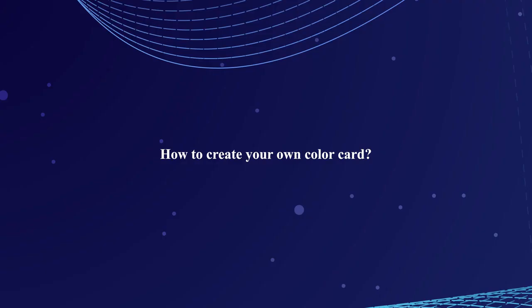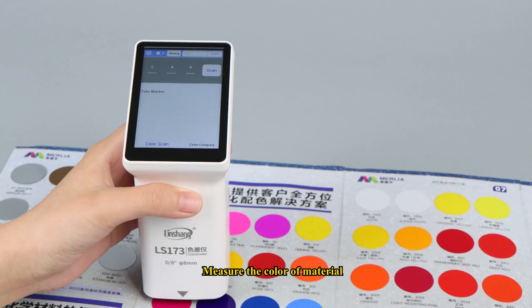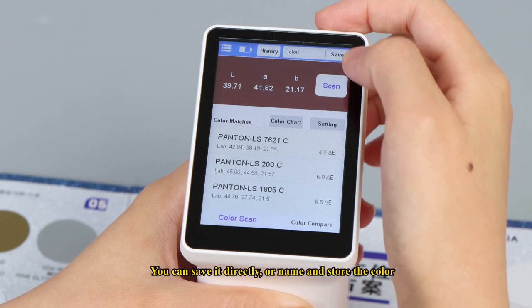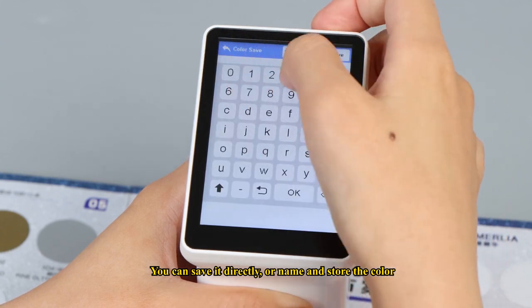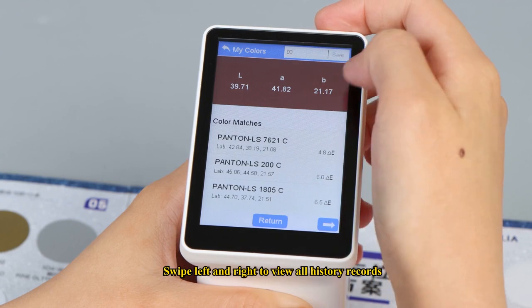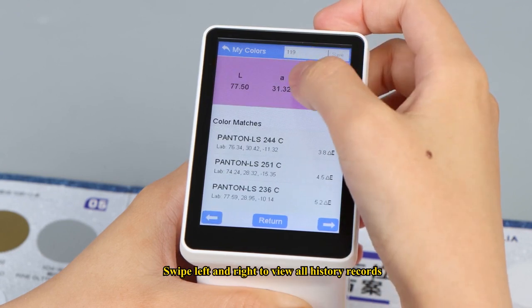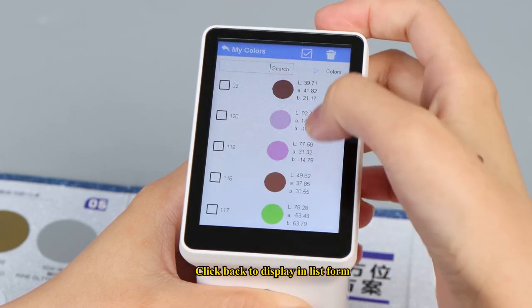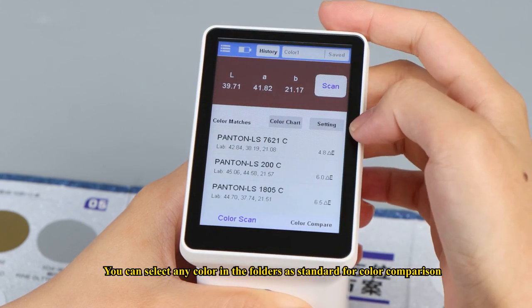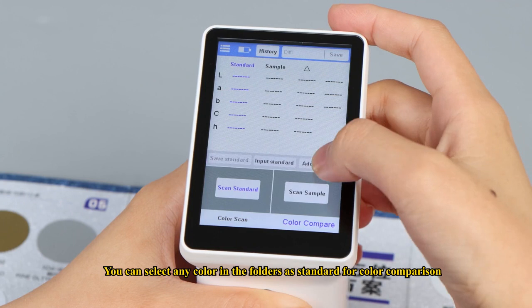How to create your own color card? Measure the color of a material. You can save it directly or name and store the color. Tap history to view the colors in the swatch library. Swipe left and right to view all history records, or click back to display them in list form. You can select any color in the folders as a standard for color comparison.